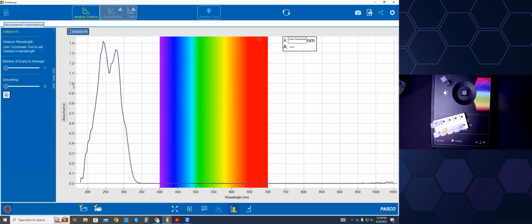But if you are going to do quantitative analysis, which is coming up in kinetics, make sure that your absorbance is between 0.1 and 1.0. You don't want to go above 1.0 or too much below 0.1 because you start to get inaccuracies there. Your data is only most reliable in the range of 0.1 to 1.0 on your spectrometer.